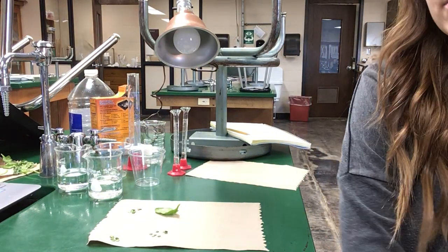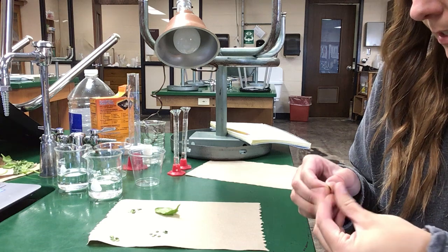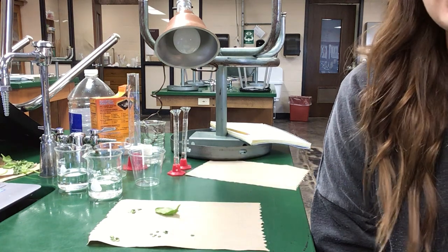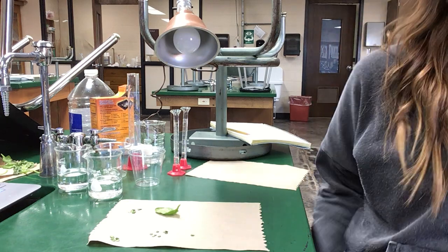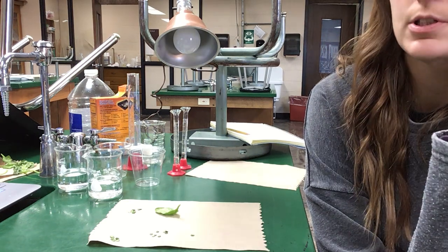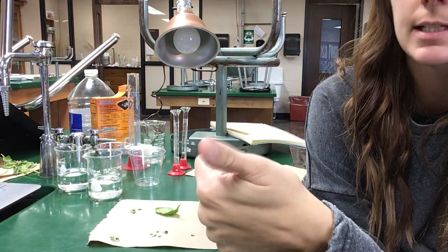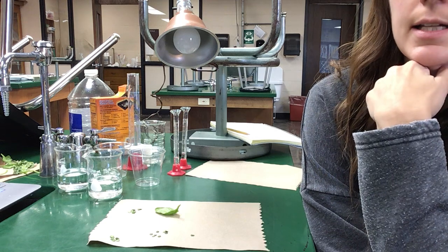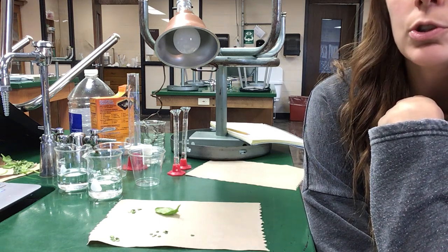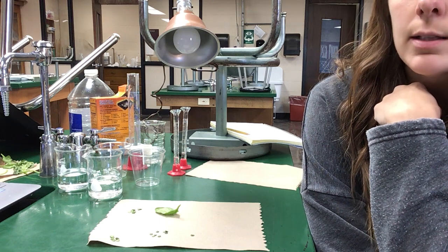All right, hey everybody. So today I'm gonna talk you through and walk you through the floating leaf disc lab. One thing to keep in mind is that we are looking at photosynthesis here, so we just have to remember the equation. Plants need carbon dioxide and water, and they take that carbon dioxide and water in the presence of light and convert it to sugars or glucose, and then oxygen as a waste product.